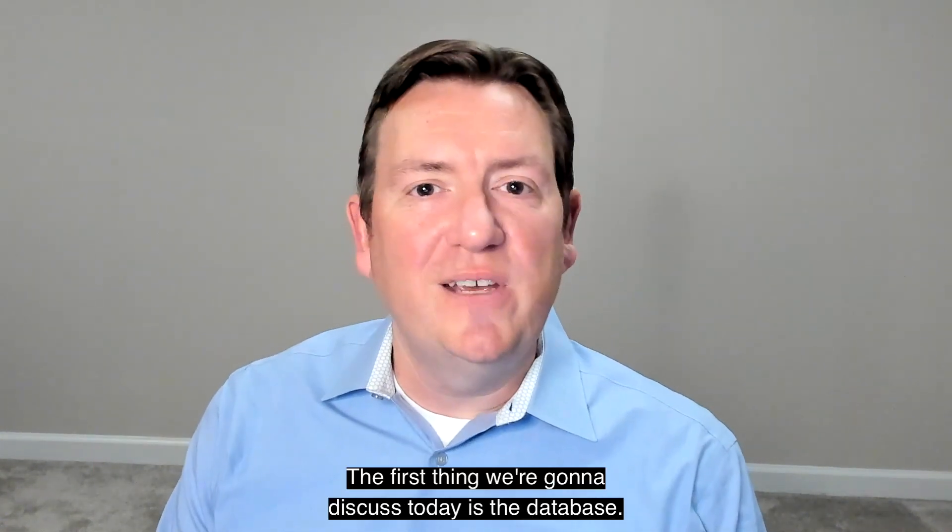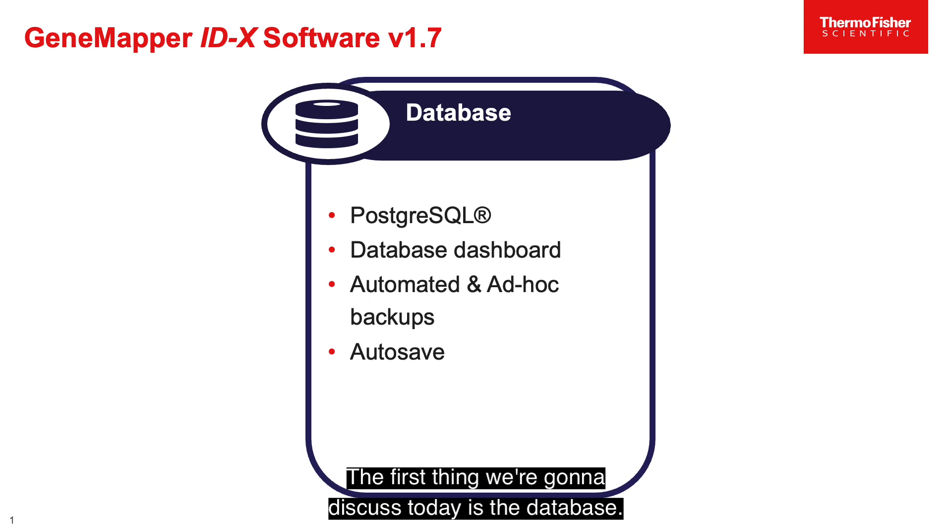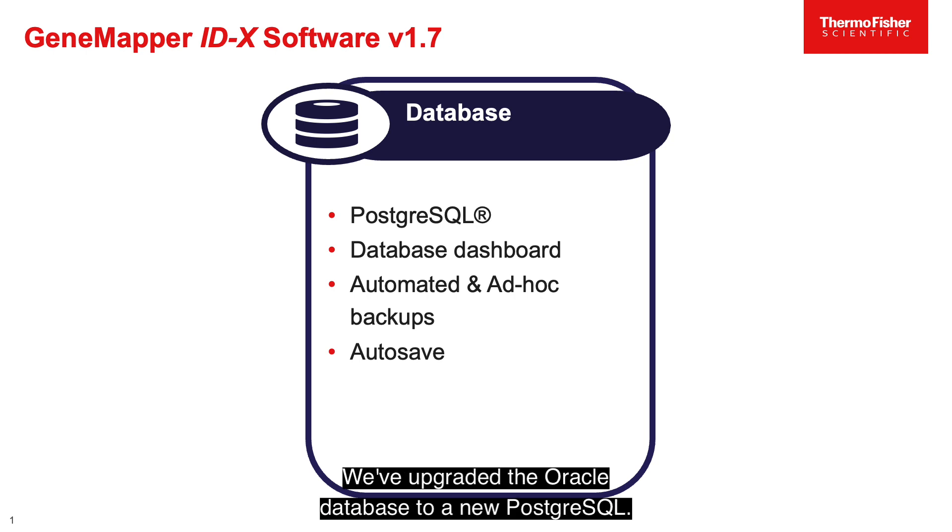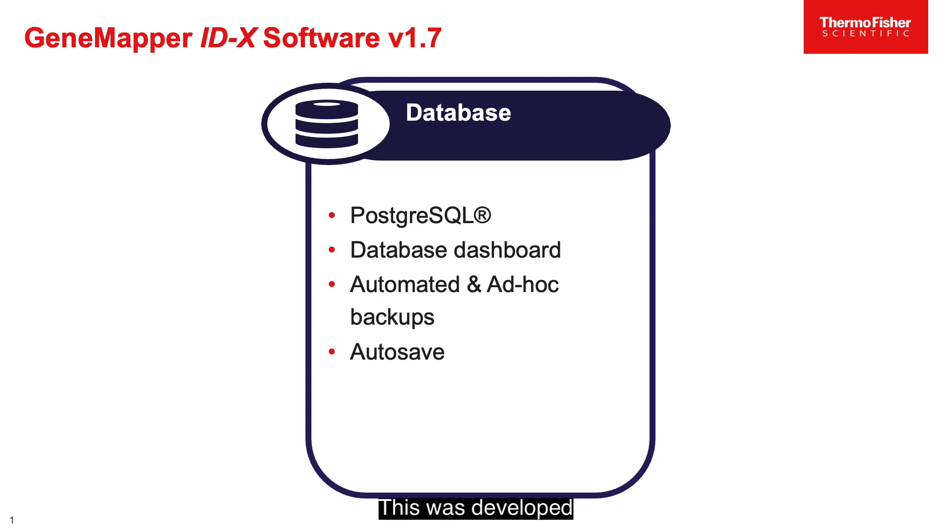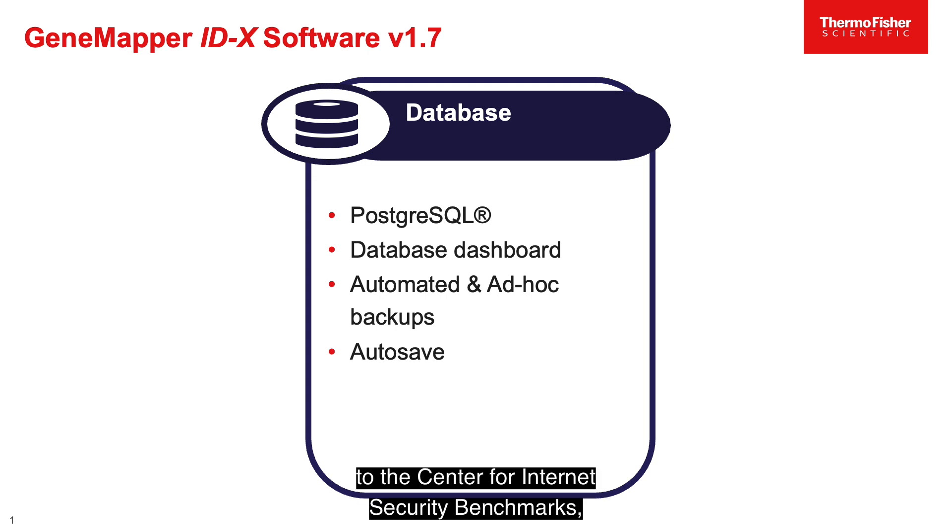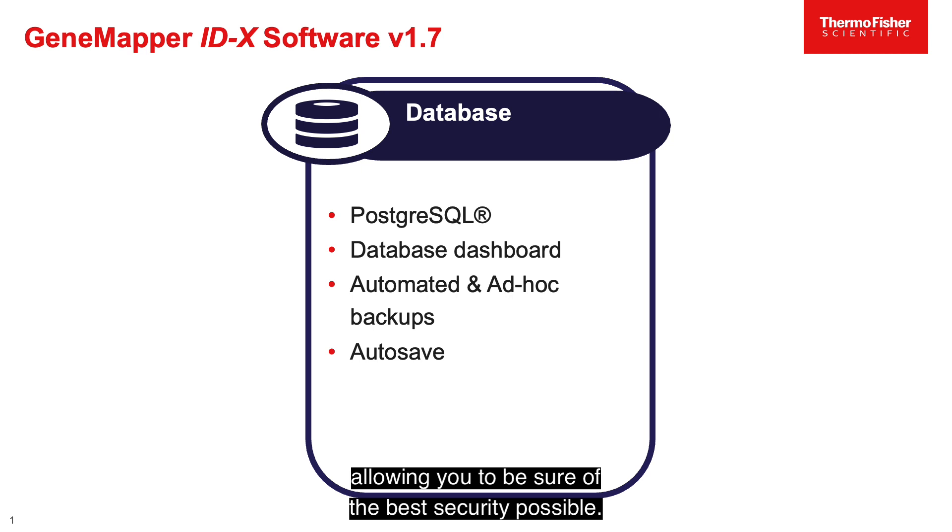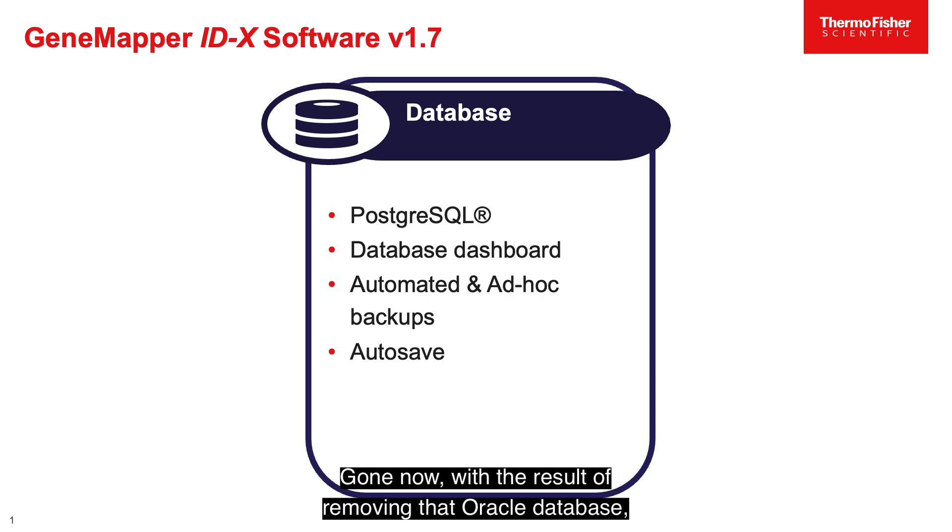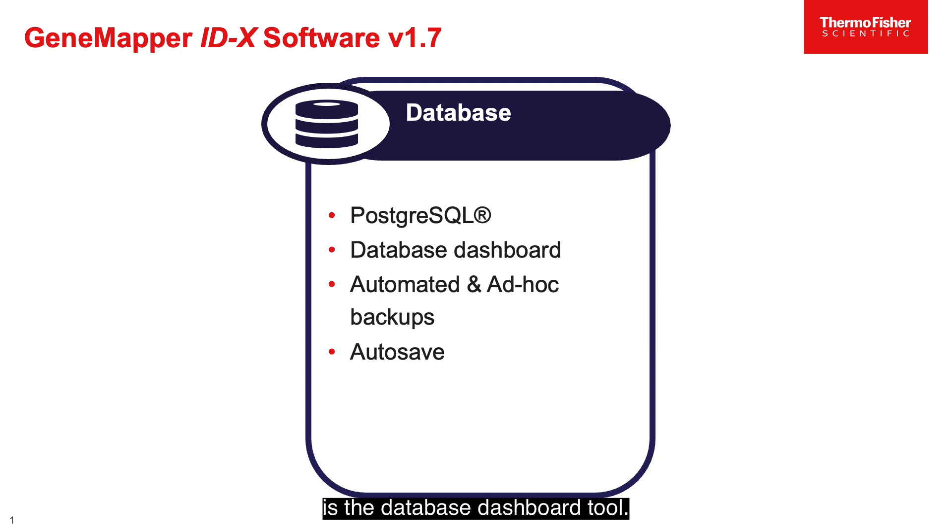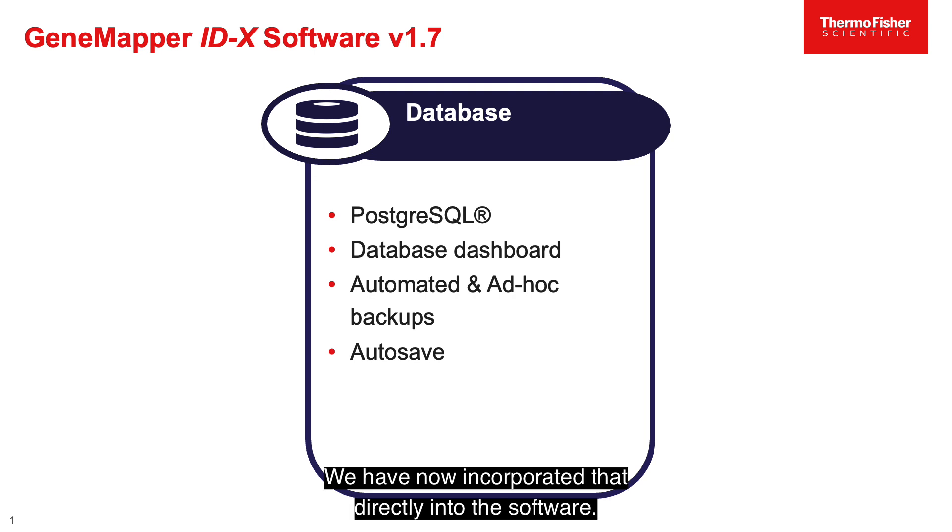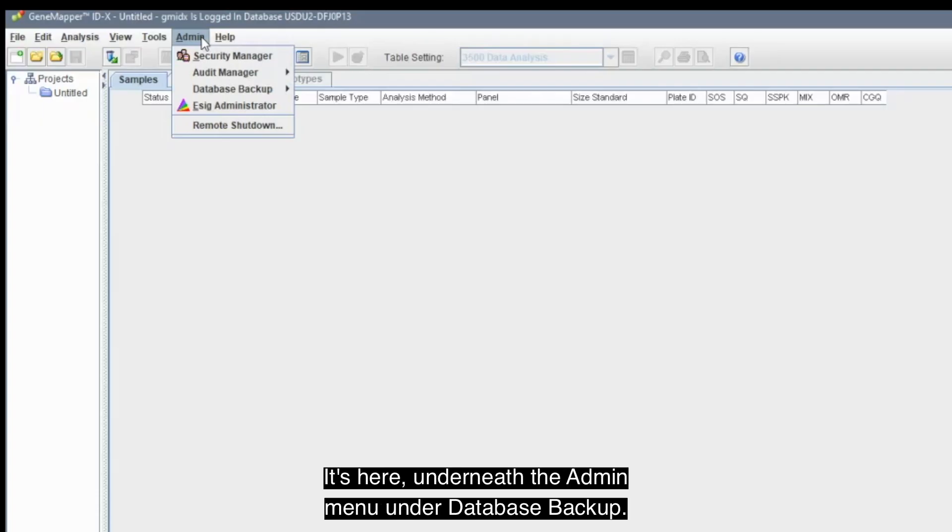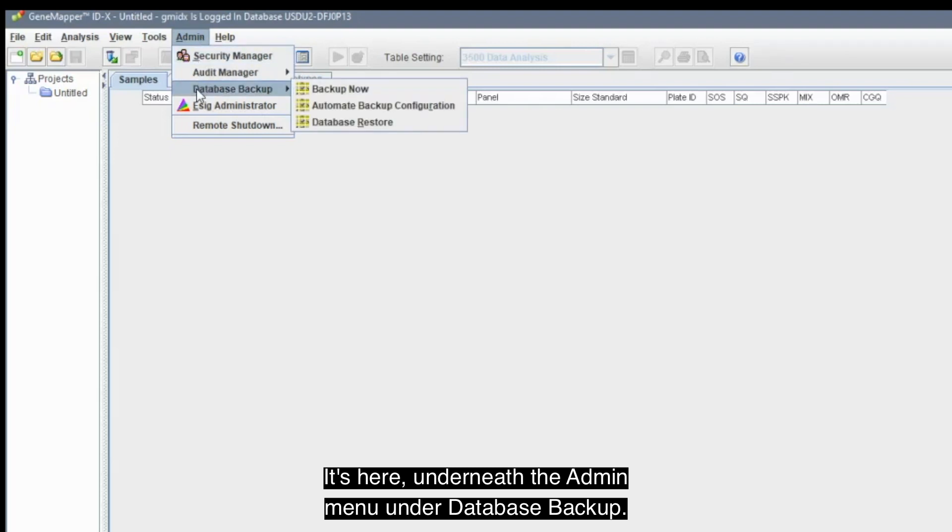The first thing we're going to discuss today is the database. We've upgraded the Oracle database to a new Postgres SQL. This was developed to the Center for Internet Security benchmarks, allowing you to be sure of the best security possible. Gone now, with the result of removing that Oracle database, is the Database Dashboard tool. We have now incorporated that directly into the software. It's here, underneath the Admin menu, under Database Backup.